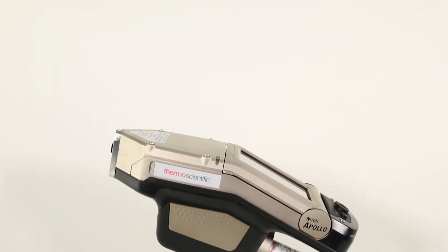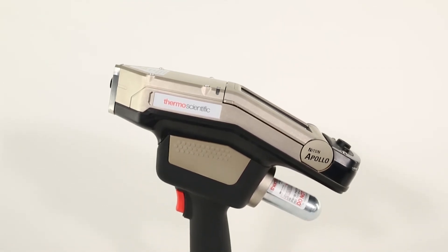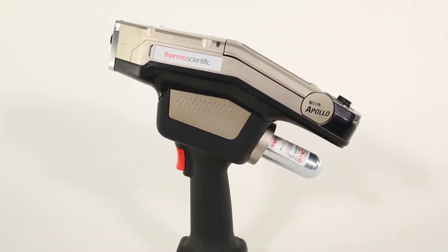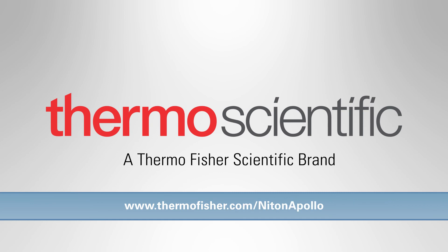You have now successfully prepared a sample for the Niton Apollo LIBS Analyzer. For more information, visit ThermoFisher.com/NitonApollo.